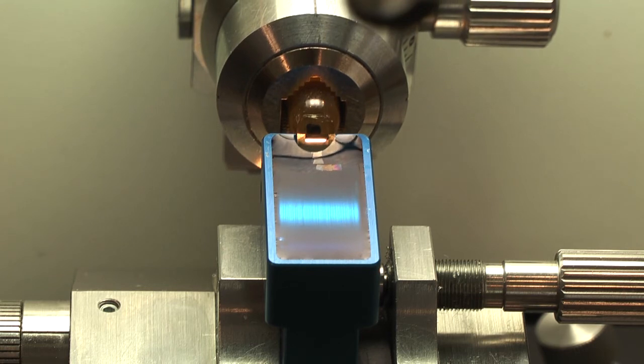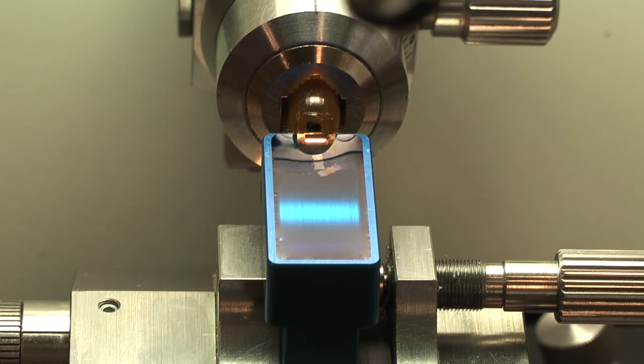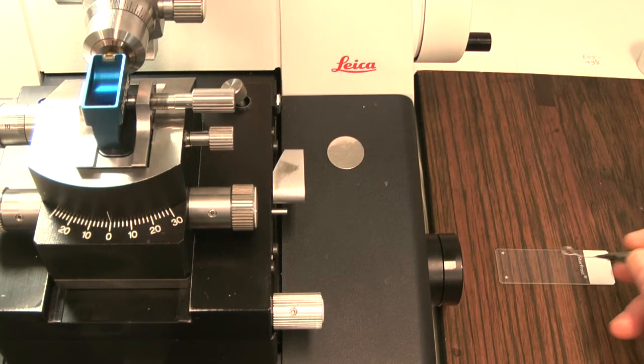A diamond knife is used to cut ultra-thin sections. A ribbon of section is placed in a water bath. For sequential EM and RCM, the sections are isolated in pairs. Then a pair is split into single sections. The first section is placed on a grid by carefully placing the grid under the section and slowly raising it at a slight angle. A platinum wire loop is inserted beneath the second section, raised with the section in the center of the loop, and placed on a clean microscope slide.